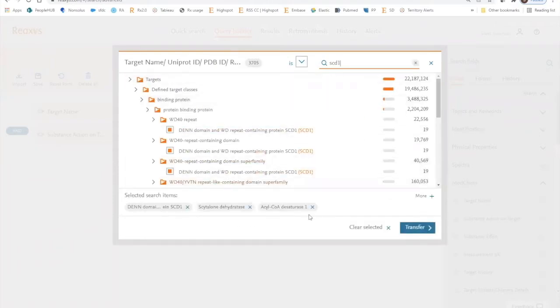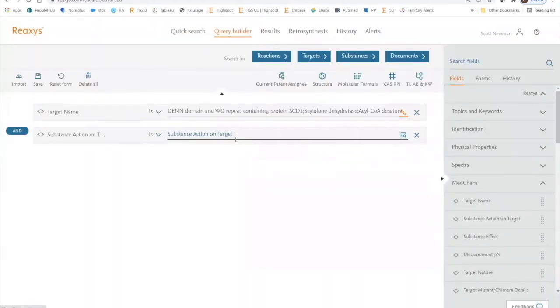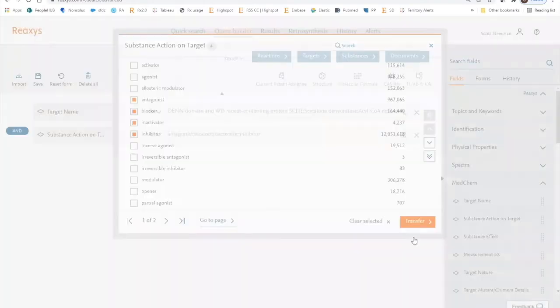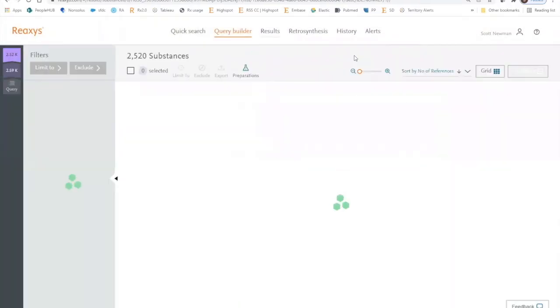It delivers synonyms of SCD1, which we'll then transfer over to the workspace. For substance action on target, we'll click on the search icon on the right-hand side and select multiple synonyms for inhibitors. Transfer those over to the workspace. And now we have a search for inhibitors of SCD1 and we'll perform a substance search to identify those compounds.